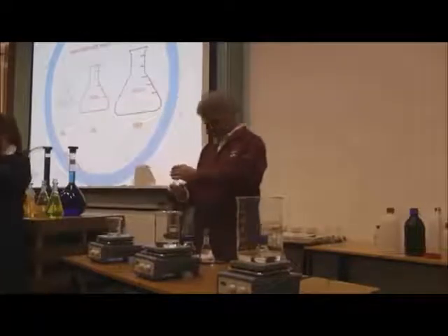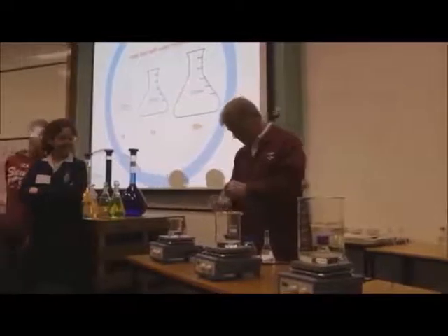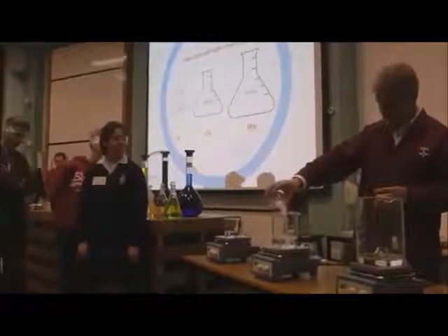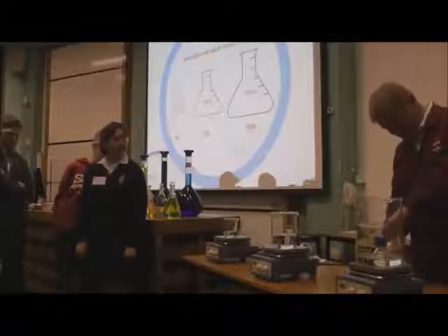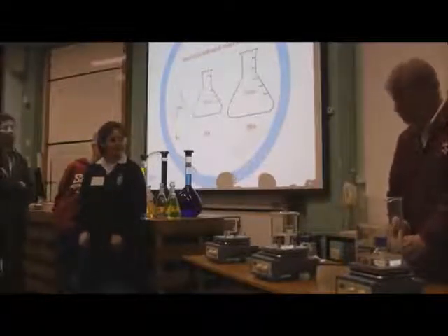Okay? Alright, so let me do this. And what I'm thinking is, it's quite an interesting... This one is 5 times the size of that one. And this one, if I can get rid of the clinker, is 10 times the size of that one. So there's 10 times as much A in here as there is in the first one.